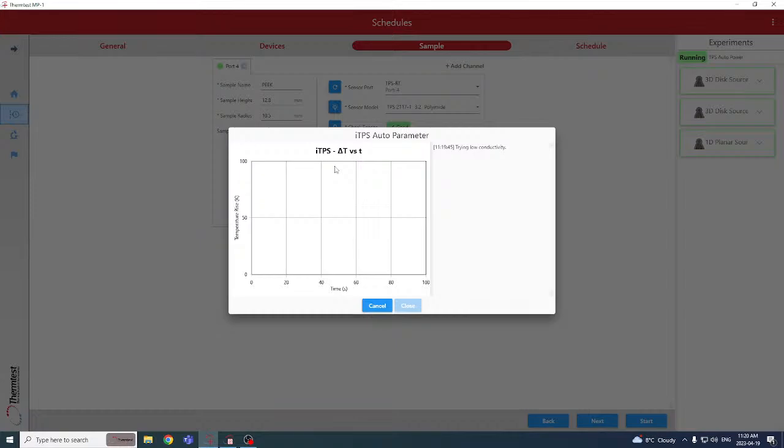The additional element that time is doing is penetrating deep enough into the sample so that you are getting a bulk shape of penetration. So this is using the three-dimensional module or method. If you're following the ISO properly, you want to penetrate at least a radius of dimension into the sample in all directions. So from the edge of the sensor to the edge of the sample, we want to penetrate at least the radius of the sensor you're using.